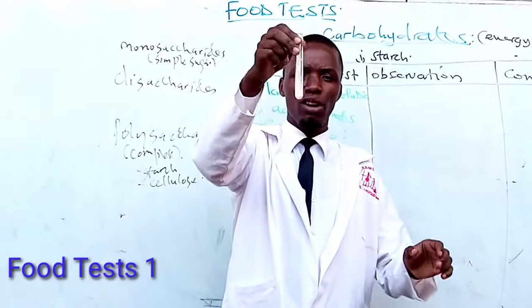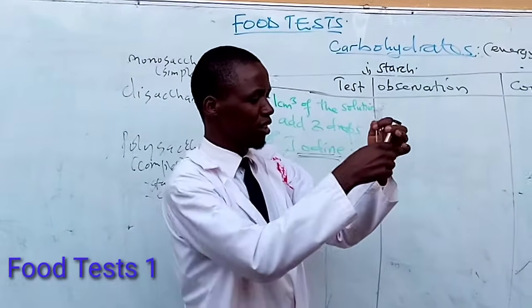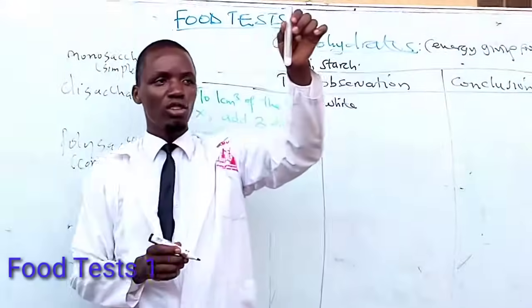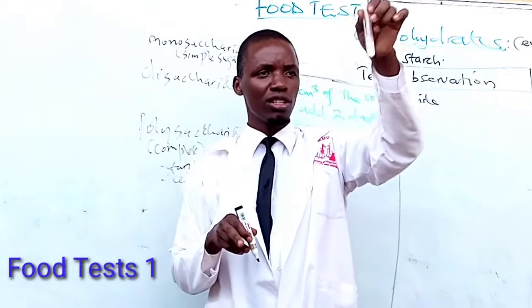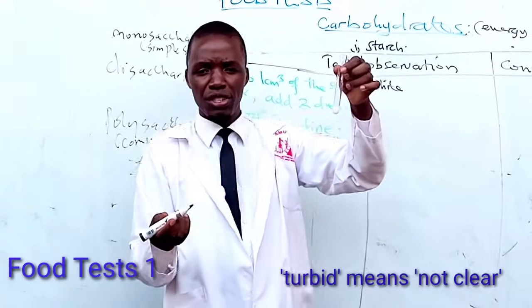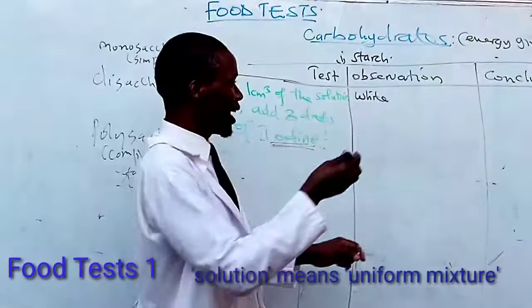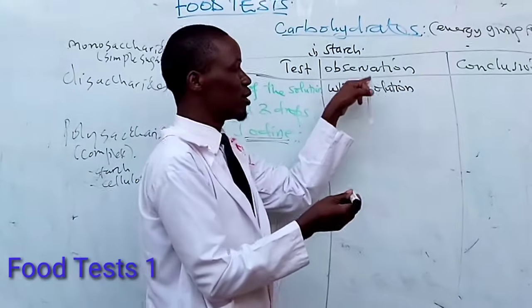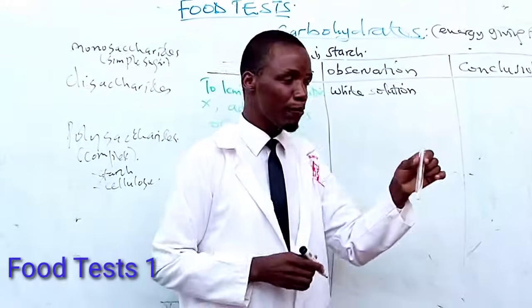Now, when you look at this solution, I want you to tell me what color it is. I think you can see it is white — so this is a white solution. When you write your observation, you need to first take note of the color of the initial solution. This solution is white, but it is also not very clear, so we use the word 'turbid.' Turbid means something that is not clear. So this is a white turbid solution.